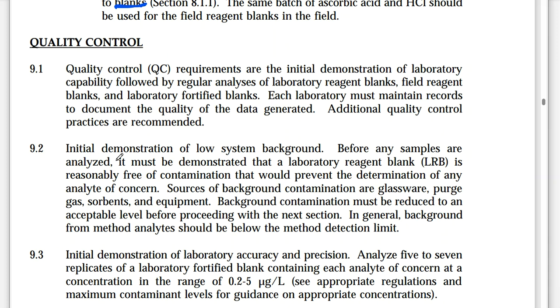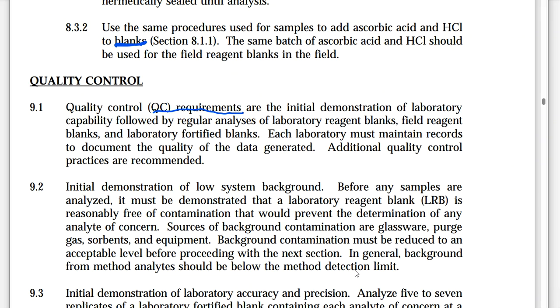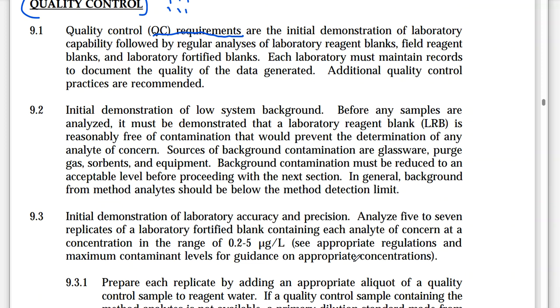This is where, of course, all of the QC requirements are going to come into play. So everything from the signal, everything from what we should be making, how many should we make, how should we handle the data that comes from it, all of this is going to be built into the quality control section. And of course, this is where the QC department would really pay attention, because they have to make sure that quality is embedded into the method. And they have to make sure that all of these are checked off.